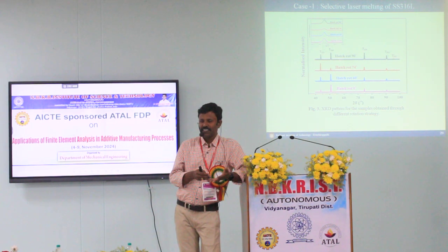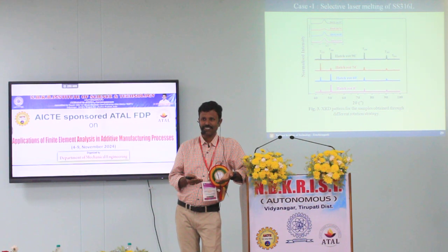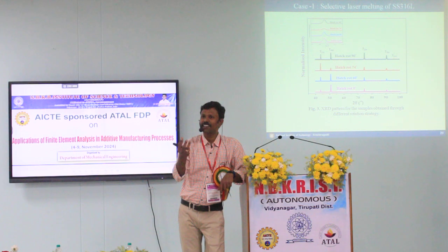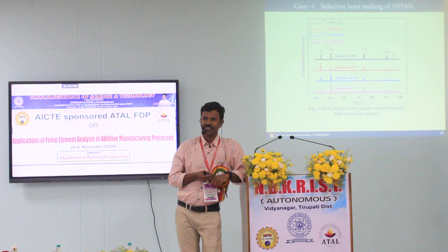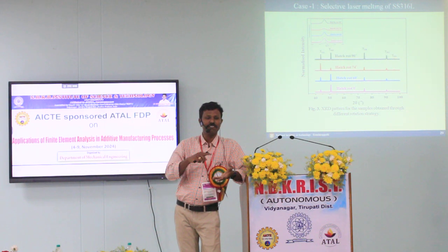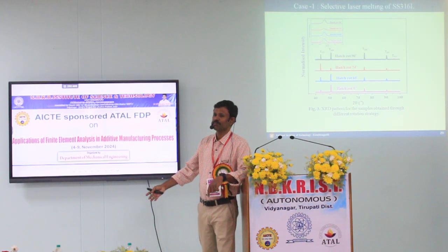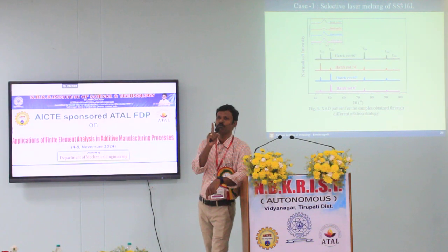What are those phases? What are their quantities? What are their crystallite size, grain size? What is the strain inside the lattice? Beyond that, if you go, what is the dislocation density? What is the stacking fault energy? What is the atomic position? What is the lattice disorientation? You can list some 30-40 applications from one XRD scan.